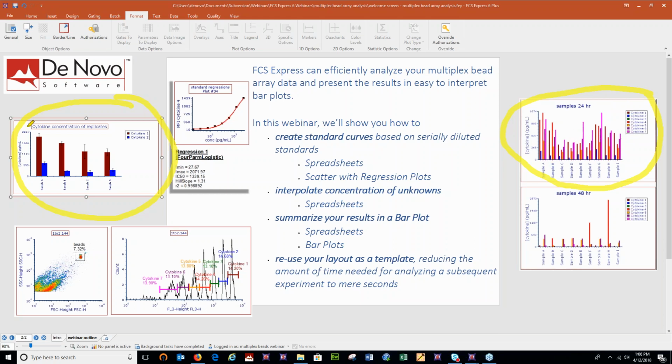Okay, so there's really a lot of flexibility about how you want to present your results, and it depends on the logic of your experiment and what you're trying to prove. There's even things you can do like having p-values and testing for significance. We're not going to get into that today just because we don't have time, but we do have another webinar which goes further into depth on that matter, and I'll point that out at the end of the webinar where that archived webinar is, because I think it might be relevant for some of you, especially if you're analyzing replicates.